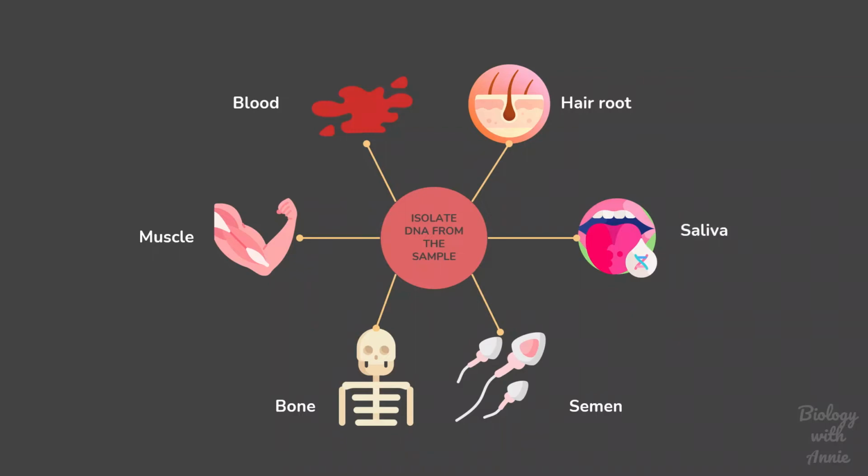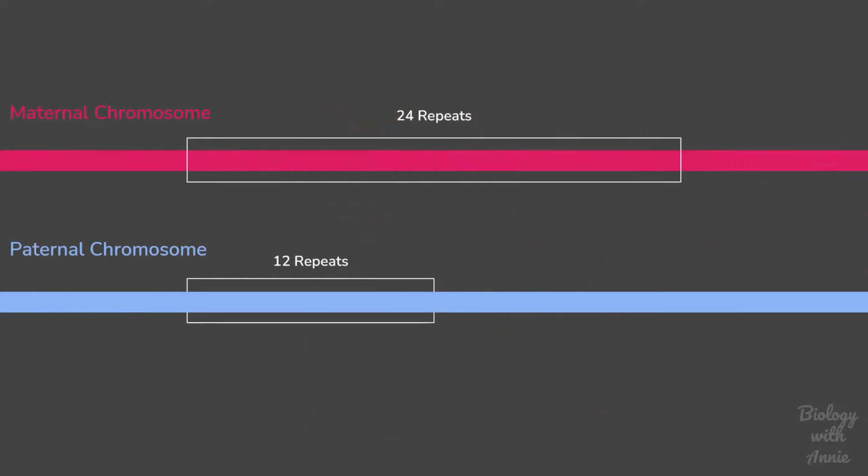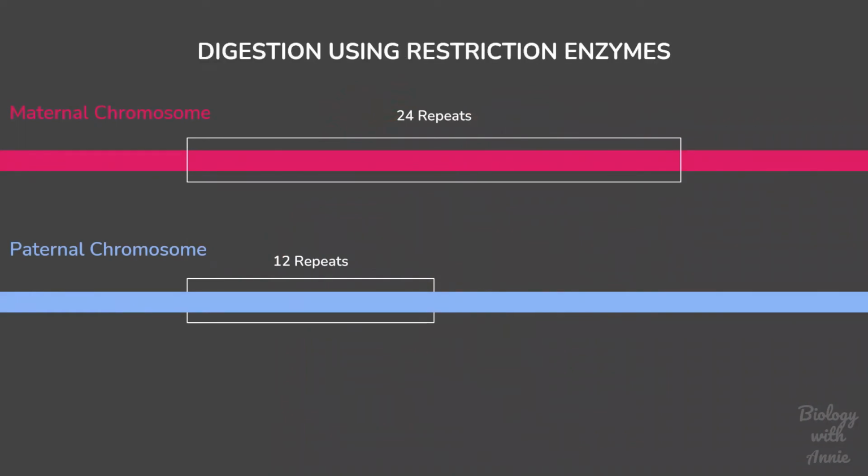Once the DNA is extracted, it is fragmented using restriction enzymes. Restriction enzymes are enzymes that cut DNA at specific sites. HaeIII is an example of a restriction enzyme used in DNA fingerprinting. It recognizes the sequence GGCC and cuts the DNA at the center of this sequence. GGCC is a sequence that can be commonly found throughout the genome, even near the VNTR region. This causes the entire genome to be cut into thousands of pieces varying in length.